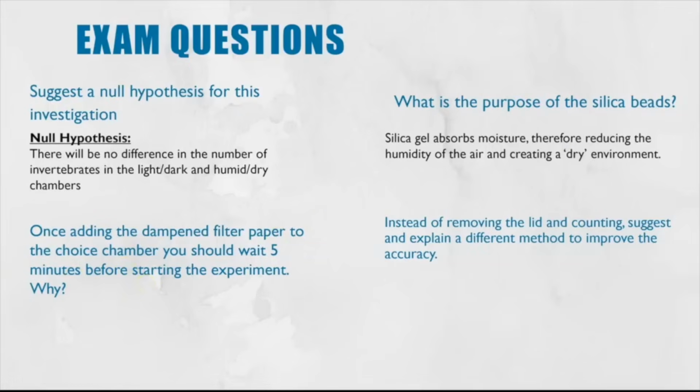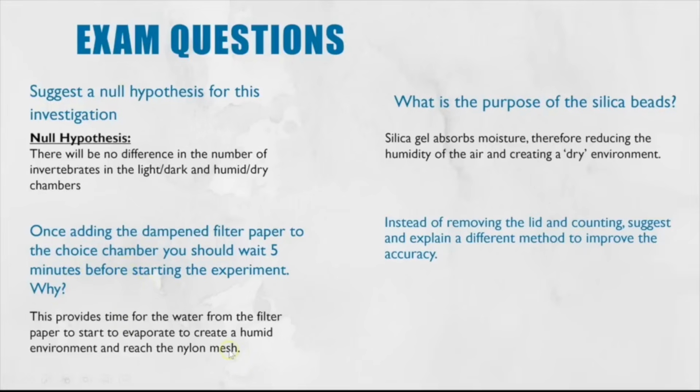So why should you do that? And that is because it provides time for the water, which has been added to the filter paper, to start to evaporate. And that will then create a humid environment in that chamber, and as the water evaporates, it will reach that nylon mesh and it will be more wet.